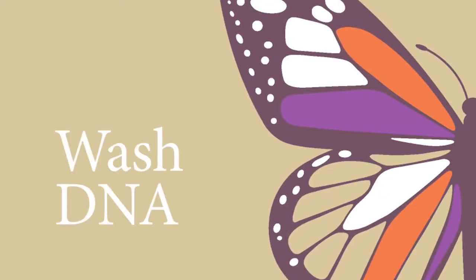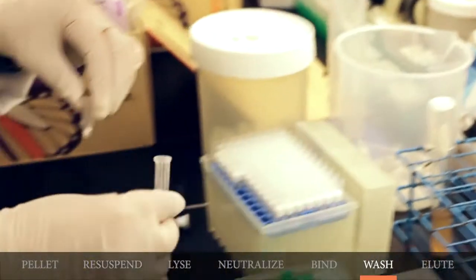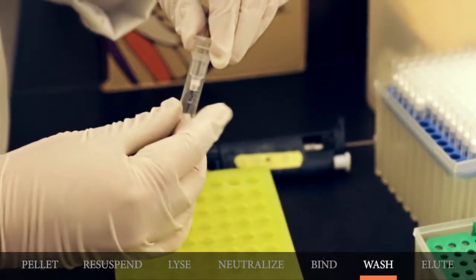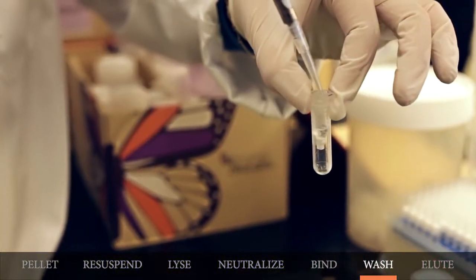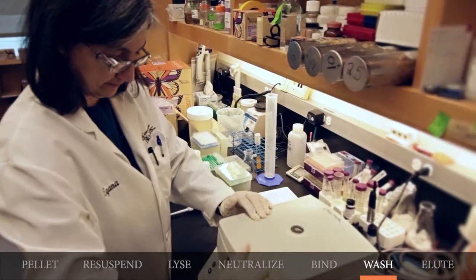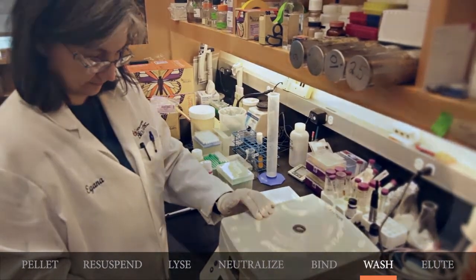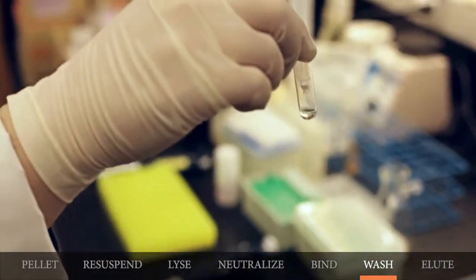Now the washing begins. Reinsert the column into the collection tube and add 200 microliters of the Plasmid Wash Buffer 1. Centrifuge for one minute. You may discard the flow-through at this point, but this step is optional.